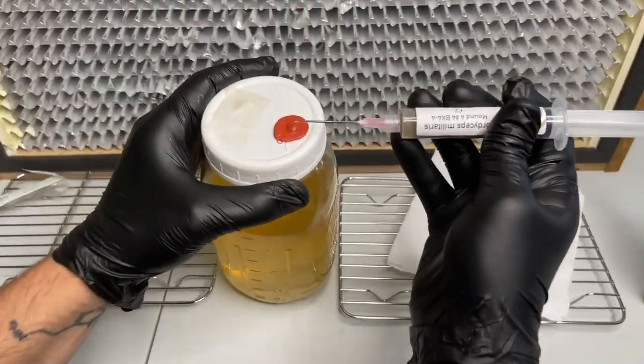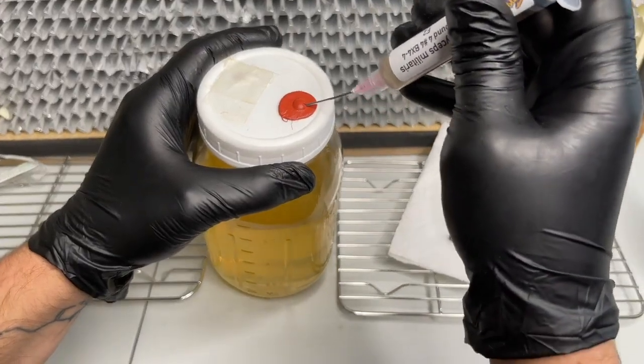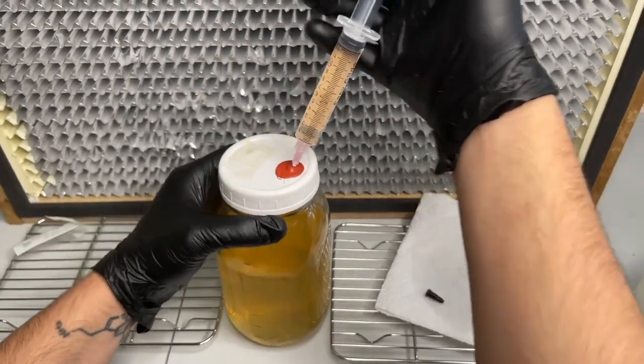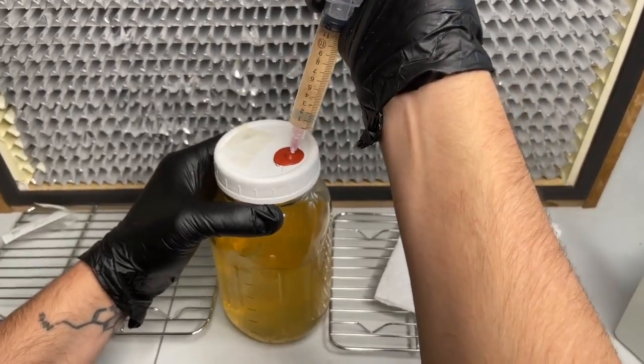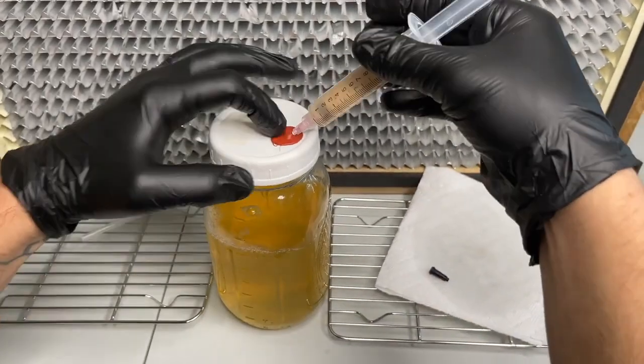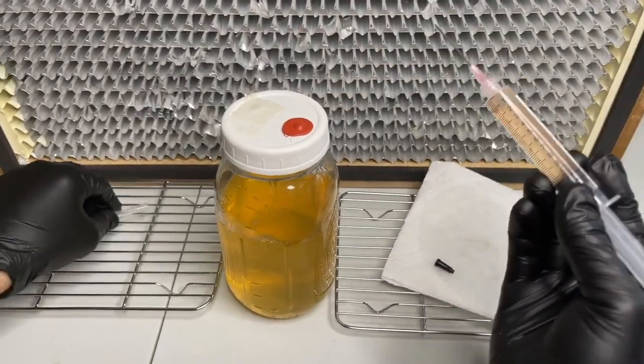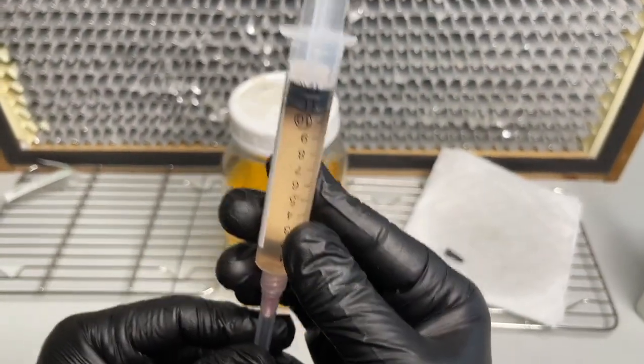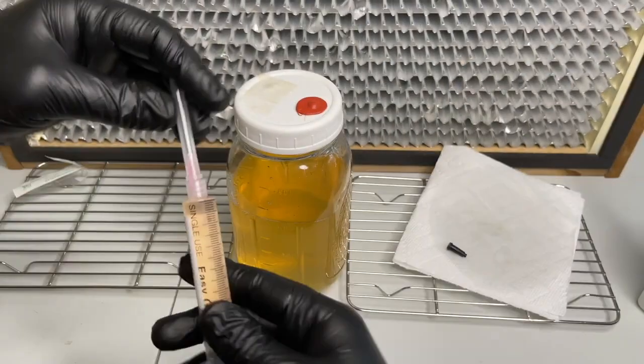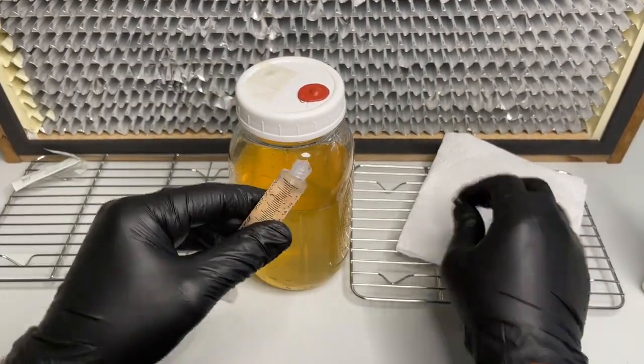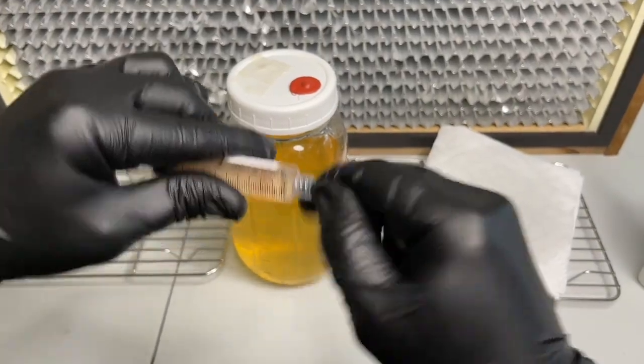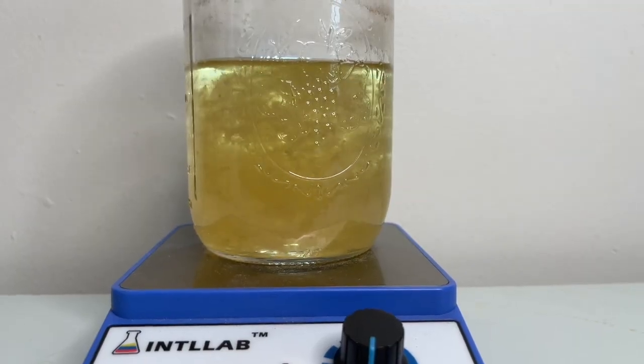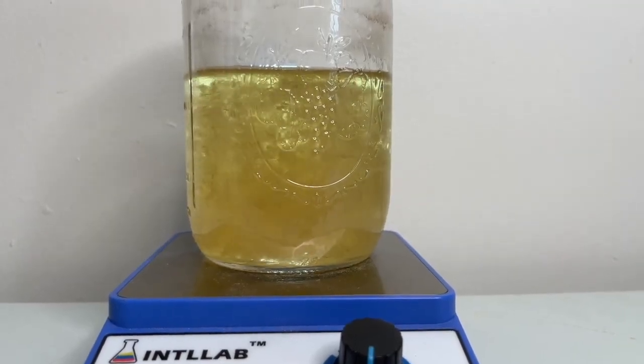Now inoculate your sterilized honey water with one to two milliliters of the liquid culture. The liquid culture should now be incubated in the dark at no higher than 70 degrees Fahrenheit. After about five days of using the magnetic stir bar the liquid culture should look something like this.